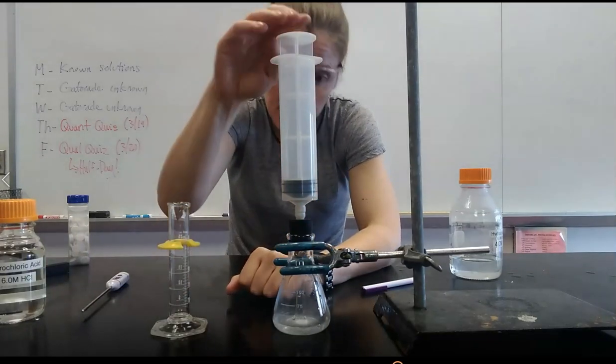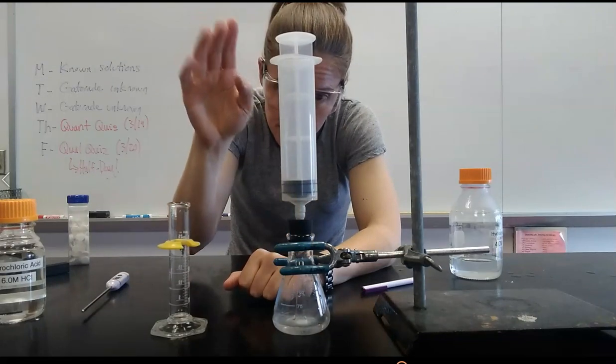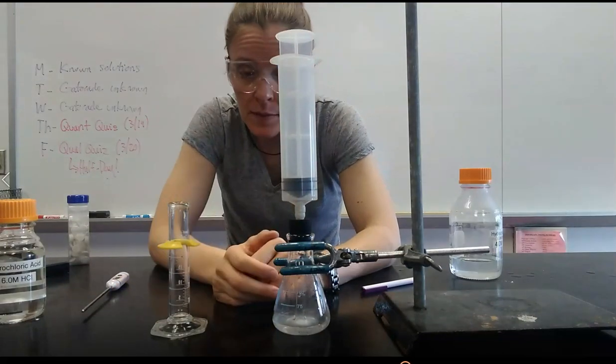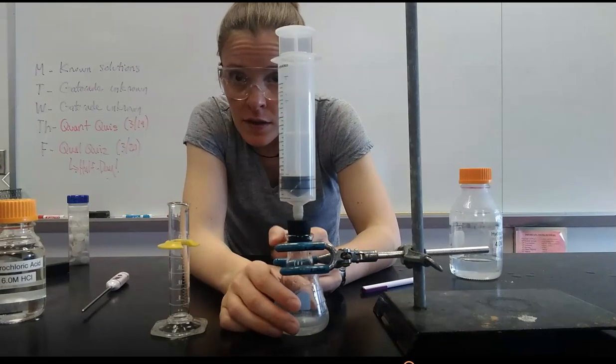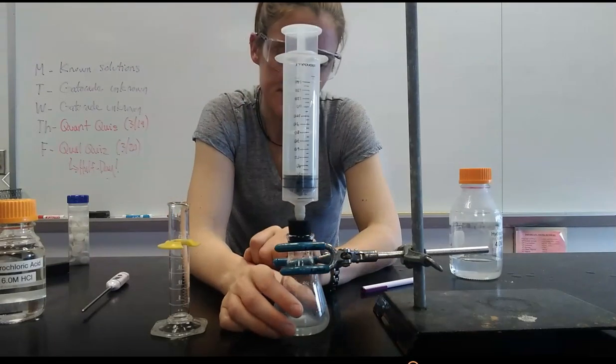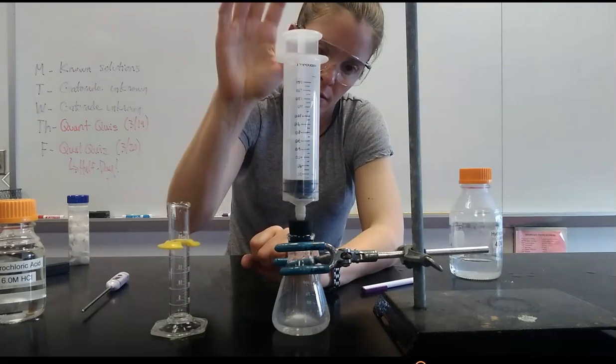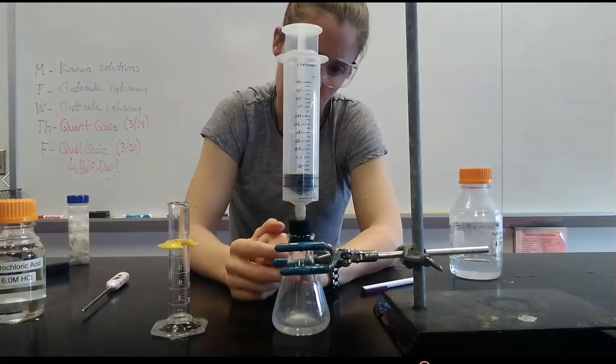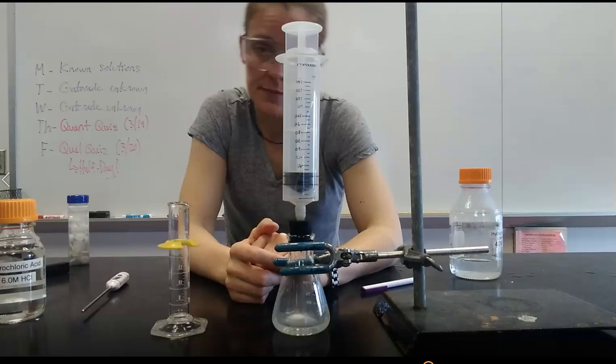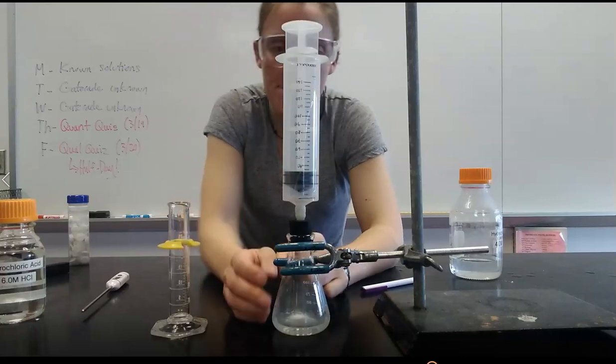At the 10 second mark I'll push down. You can see that it bounces back up as the gas is produced and keeps moving the plunger. 10 second mark, press down. 15 second mark, record. Obviously I can't get that one because the numbers are facing you.